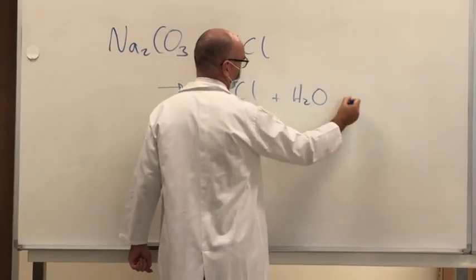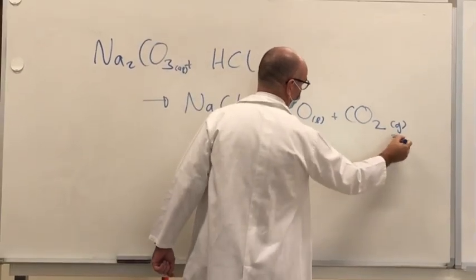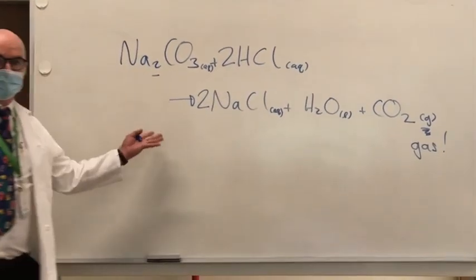Na2CO3, sodium carbonate, reacts with hydrochloric acid, making sodium chloride, water, and critically carbon dioxide gas. We can test that carbon dioxide with lime water, which will go milky. Let's have a look at this reaction.